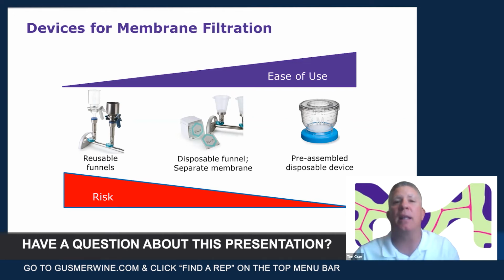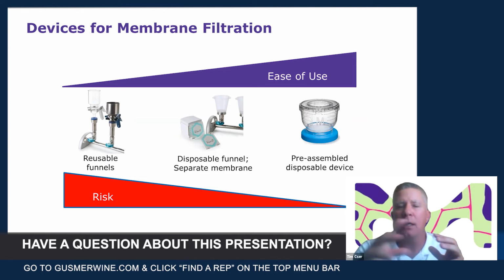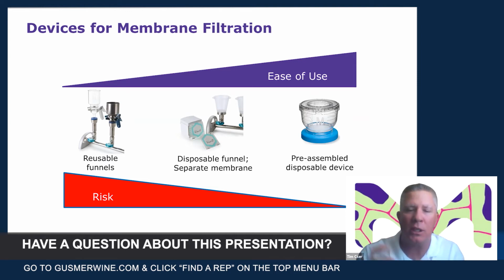So it's not that with wine you're going to exceed any limits that say, oh no, we have too much of this particular product or this particular bug. It's not that you're going to ruin an entire batch of wine. All this does is allow you to be more secure in your sample that says, yes, we know that we had X amount of bioburden or X amount of yeast and mold, and we know that it wasn't introduced from the users in the lab.